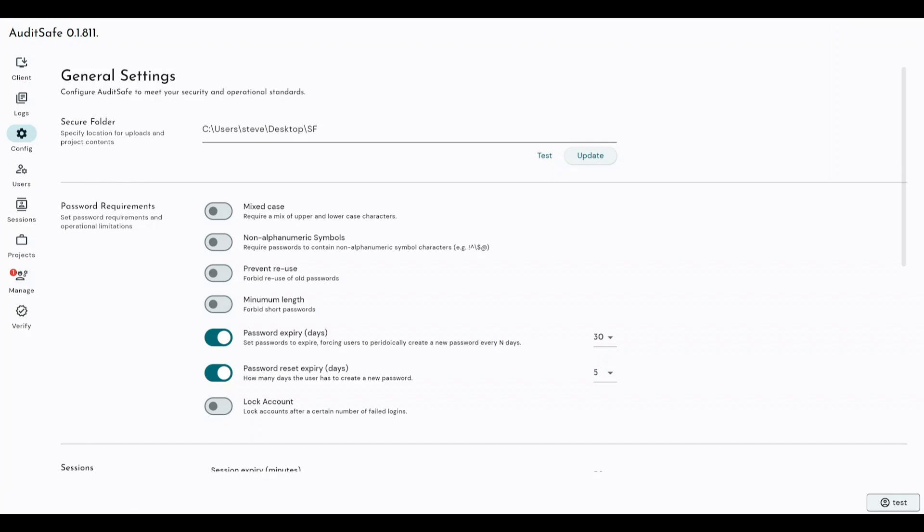They're stored immutably because whenever a user analyzes a project, they only ever take a copy of a project. They don't take the original. And then when they're finished with their analysis, they can then push their copy, their analyzed copy up to the secure folder, and then that gets added as another revision of the project. But nothing is ever deleted or overwritten to make sure that we continue to comply with 21 CFR, GAMP 5 regulations.